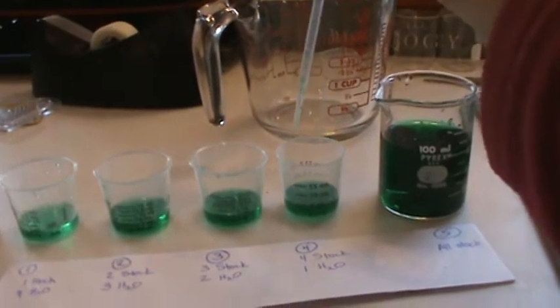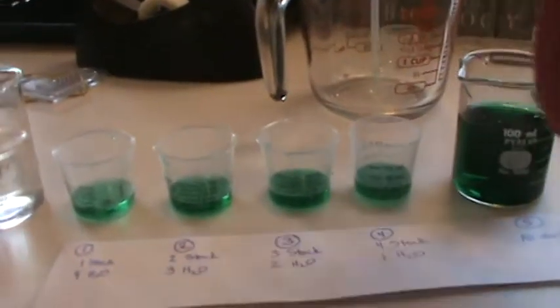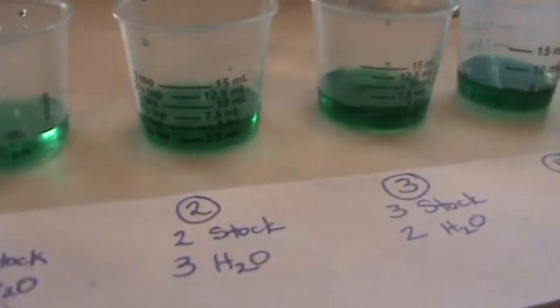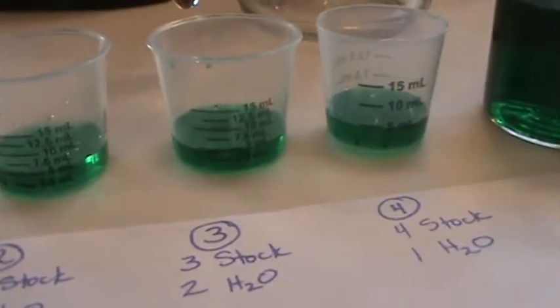Now, if you look very closely at these, you can see that they are all 5 milliliters.